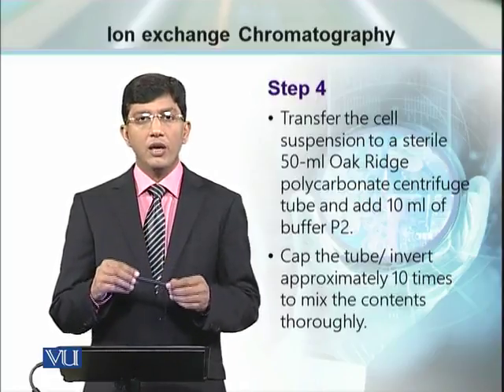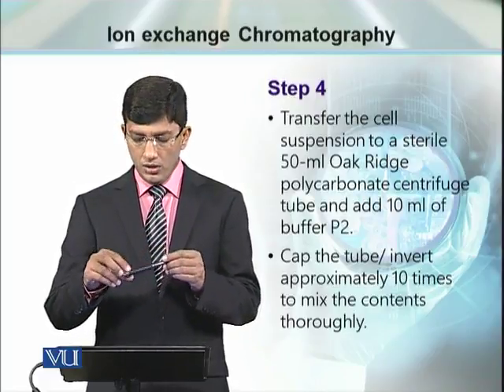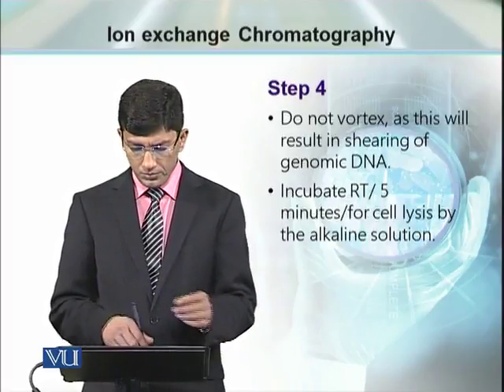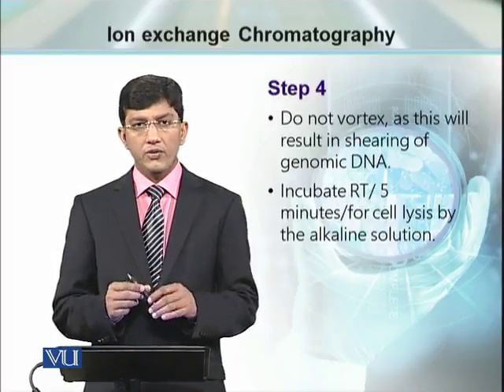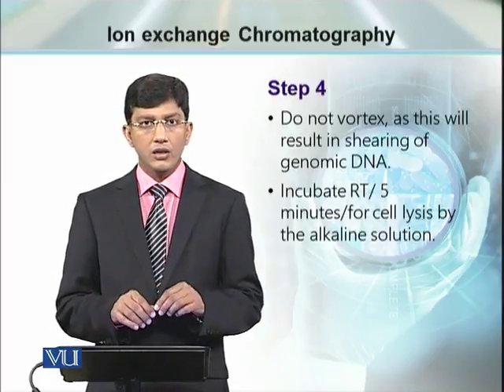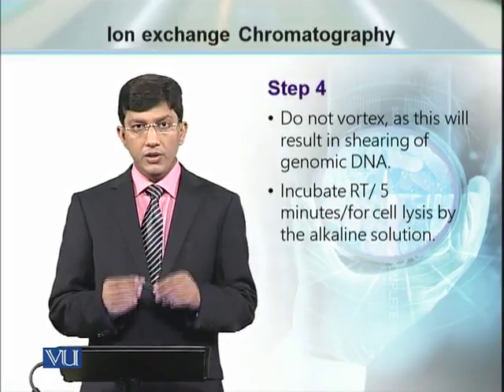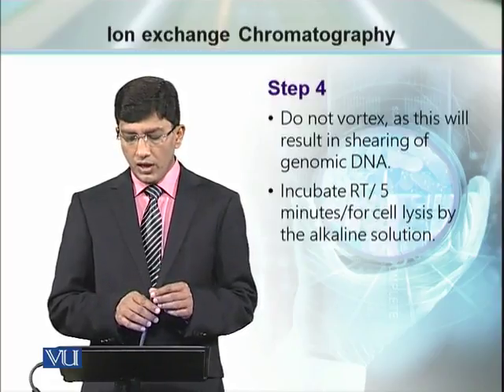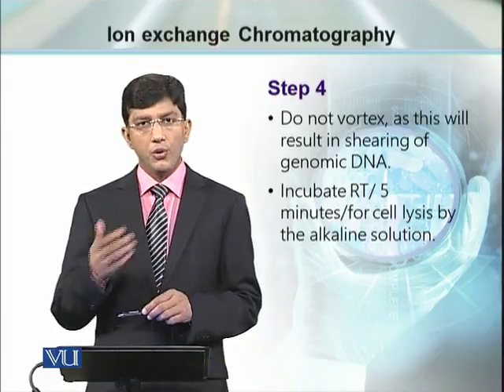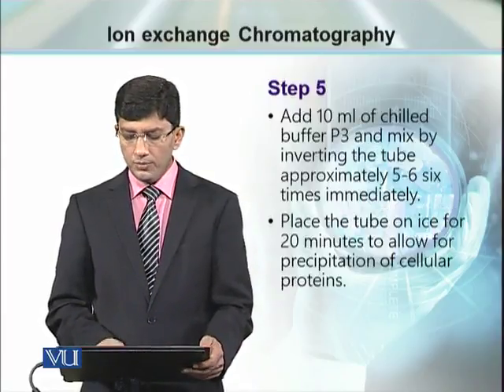And mind it, cap this tube before you start mixing the cell suspension and the lysis buffer. It is not advised to vortex for mixing, because vortexing can create problems with contamination of genomic DNA and the plasmid DNA. Leave this tube for 5 minutes at room temperature so that the process of lysis using alkaline solution can go on and maximum bacterial cells can be lysed within that time period.